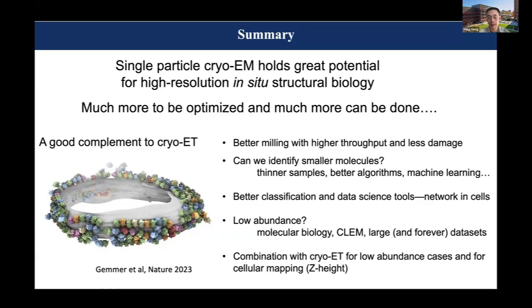So really the whole idea is in situ structural biology. Both single particle cryo-EM and cryo-ET are really the future of structural biology. And this revolution is coming up very fast.